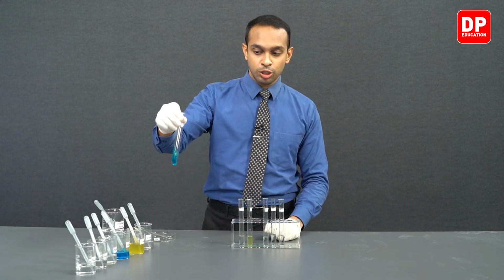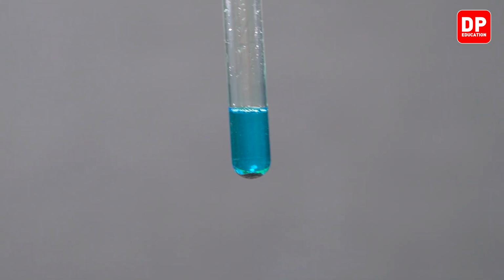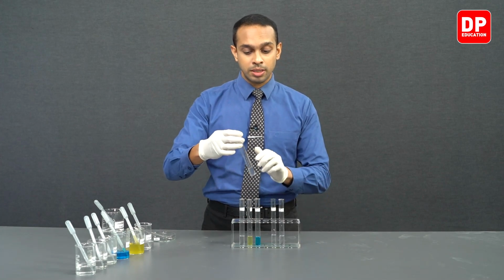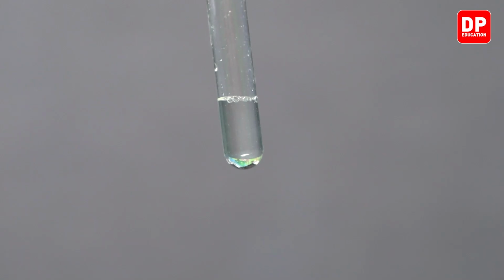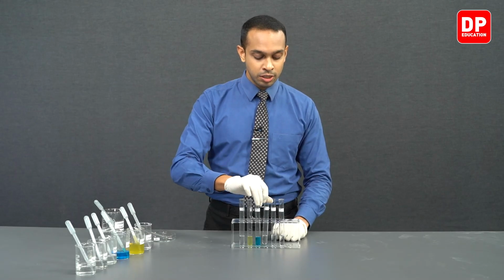So we will shake each solution like so, and then we will allow it to settle for a duration of around 10 to 15 minutes as I mentioned earlier. So I will continue to mix each of the solutions like this, and you can see you don't observe a reaction straight away.